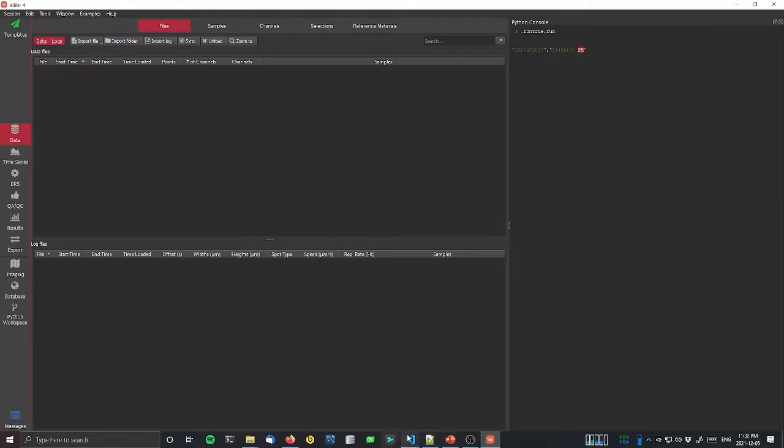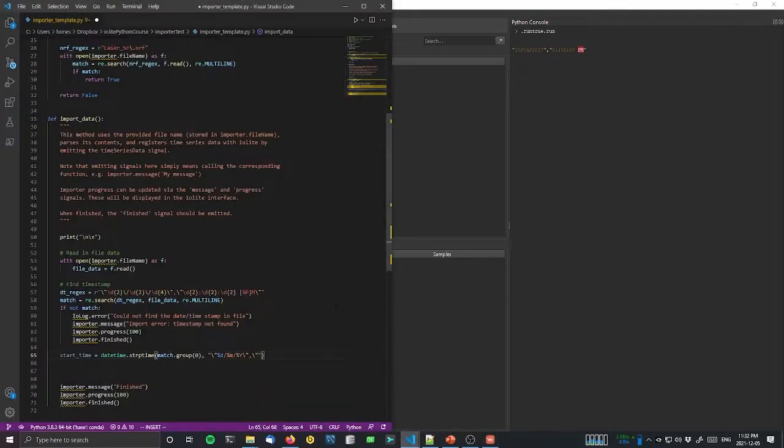So we'll put in our script %I, then %M for the minutes, and then %S, and then we have a space, and then the AM/PM part, which is %p, and we have a final trailing quote there as well. So let's write that.